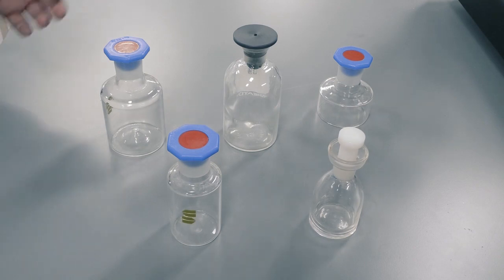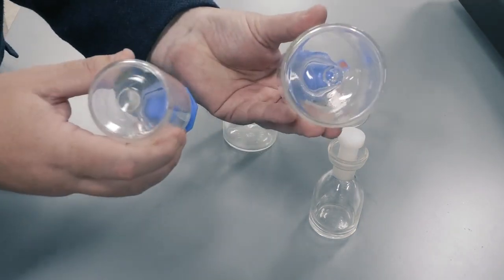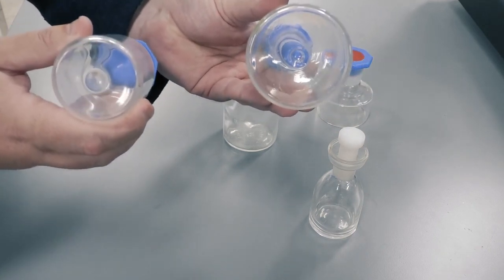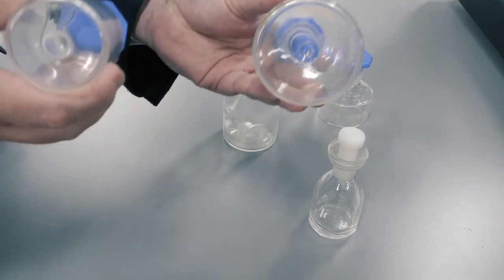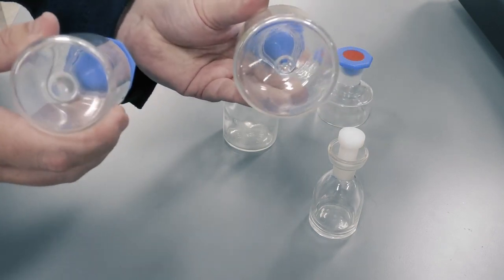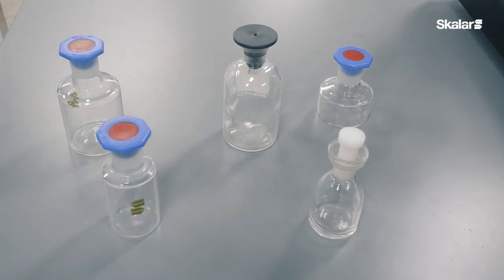So just a few examples here of the different bottles we have integrated, so a few different shapes and sizes, but what we're really looking at, so I mentioned footprint determining capacity. So if you see here, by going to a slightly smaller footprint bottle, so footprint in the tray, we would be able to go to a higher capacity per tray using these smaller bottles. Of course, the total volume is the main difference in the end.